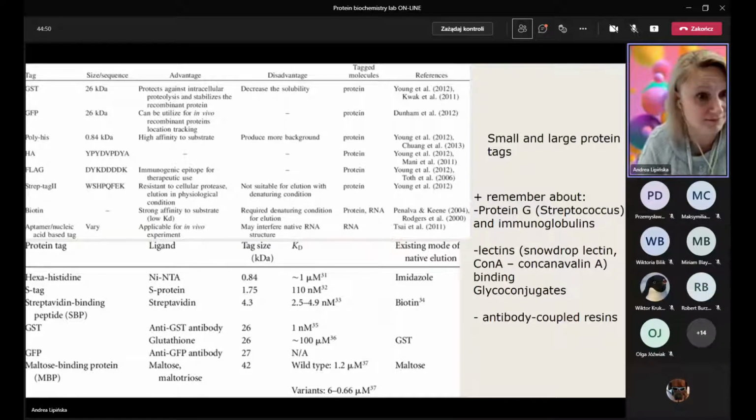We remove it, okay? You can remove it when you isolate the gene by PCR. That's, I think, the easiest way if you do not order a synthetic gene. So synthetic gene or PCR, or restriction sites, if there are suitable, good restriction sites that you can use just to remove ATG, but this will be very rare, okay? And then the stop codons come after your protein.